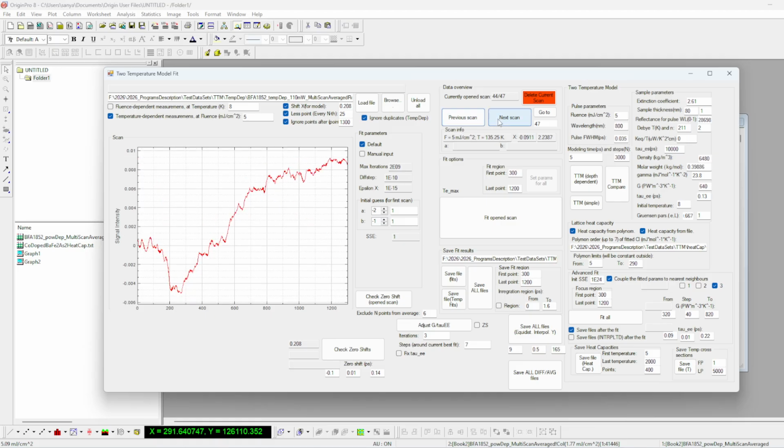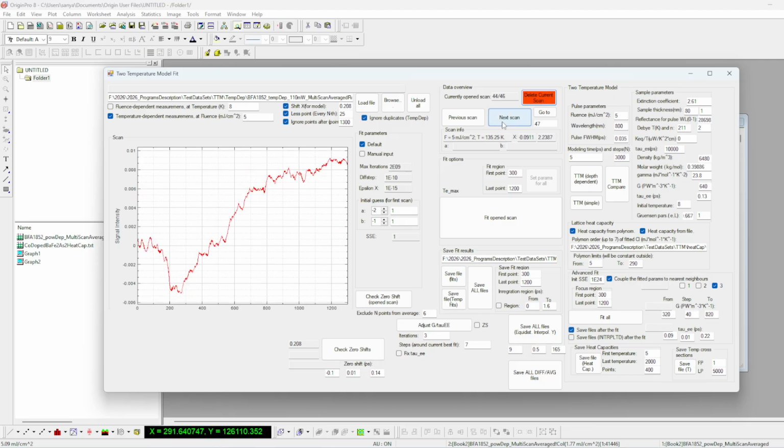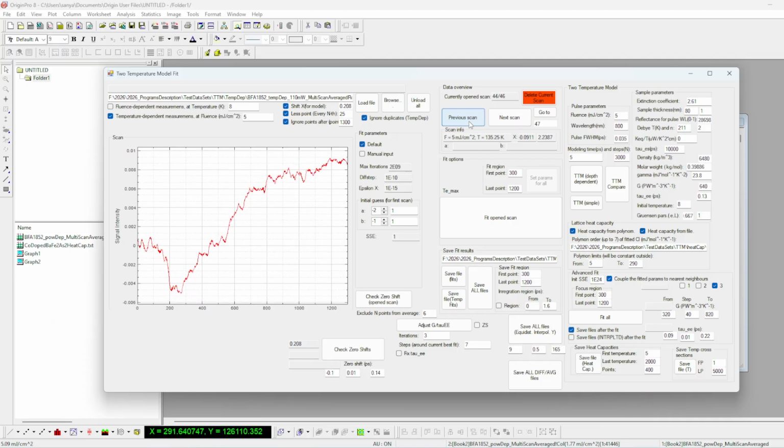This is a good detail. Another quick detail is that for some scans, for example here, we had some issue, so you can delete the current scan with the button delete, and then when you interpolate, it will not use that scan. It's also an important thing, so your map will not be corrupted by bad scans. This is for the loading.